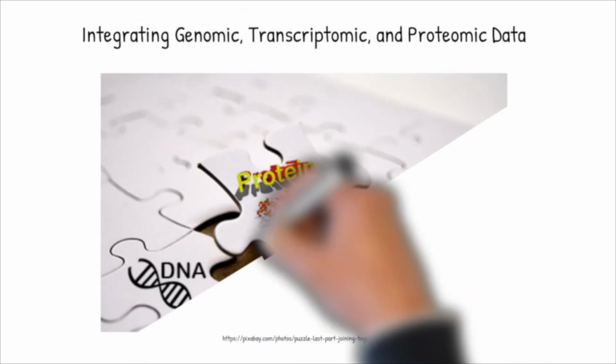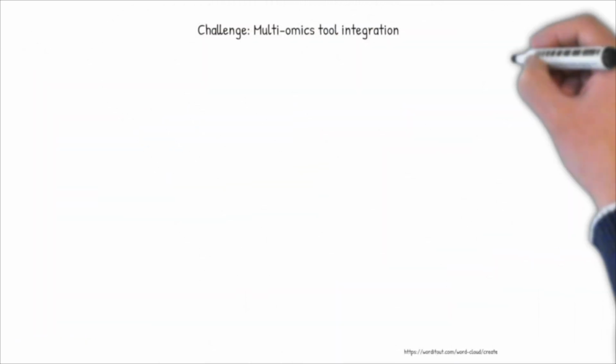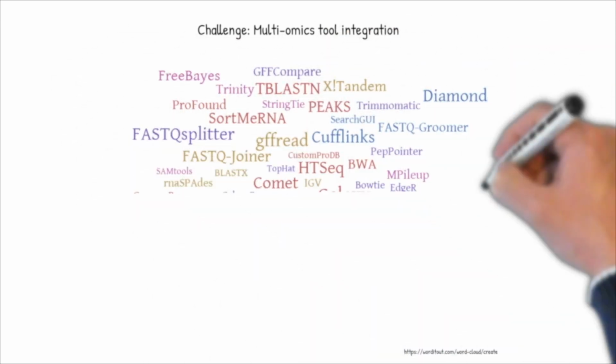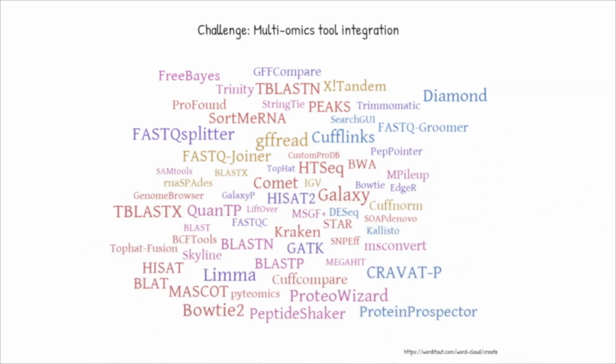Integrating proteomics data, which directly detects the expressed variant proteins, with the genomics and transcriptomic approaches helps reveal the mechanisms of cancer development and progression. Integration of many software and tools is required to perform a multi-omics analysis like proteogenomics. There are many useful genomics, transcriptomics, and proteomics software tools available. However, there is a need for a unified platform that can enable their integration.